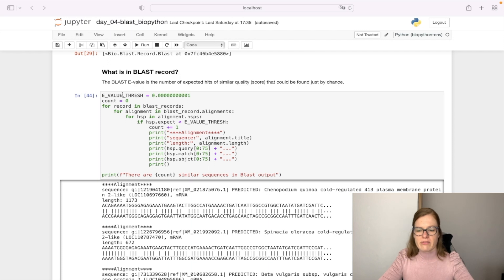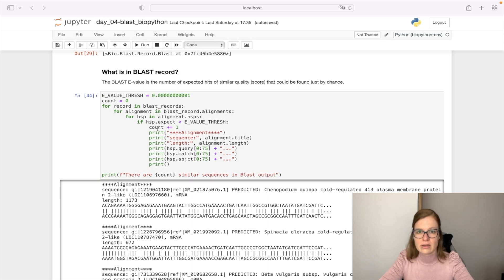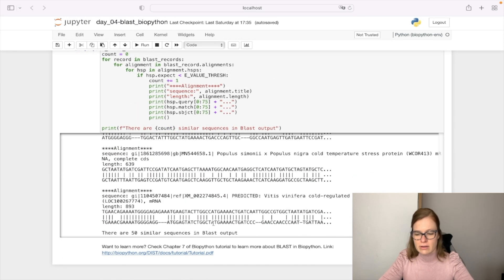We are going to specify the E-value threshold. The BLAST E-value is the number of expected hits of similar quality that could be found by chance. We will go through our BLAST records — we only have one record — and go through all BLAST alignments, checking only those with an E-value lower than our threshold. We count how many there are and print the sequence, the length of the sequence, and the actual alignment. We can see that in the end there are 50 similar sequences in the BLAST output.